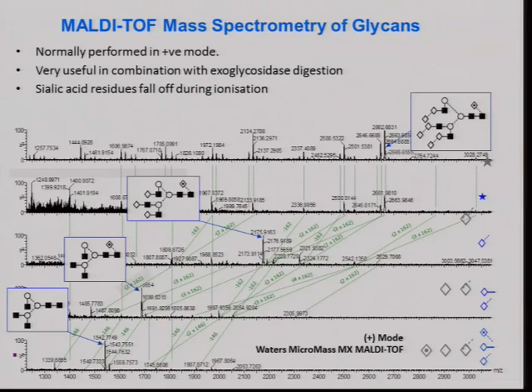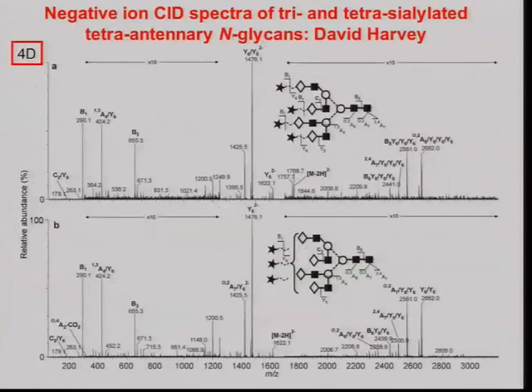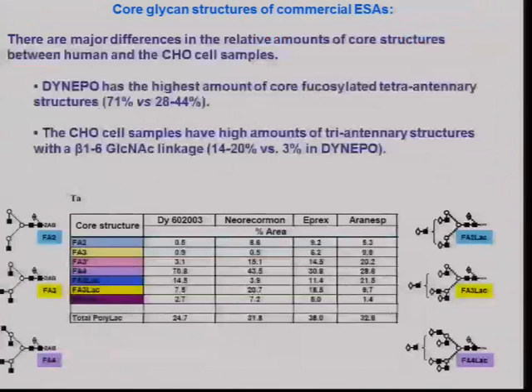So if you really want to use mass spectrometry, that's great, and you can use these enzyme digests just as you would in LC to improve the understanding that you have of the peaks in these different pools. So instead of an LC profile and looking at the enzyme digests, you're going from a mass spec profile to a mass spec profile. This is really useful. And you can pull out a particular ion that you're interested in, this very complex ion here, and you can do fragmentation, and you can identify where the sugars are, and you can get information that you can never get from LC. So this is why mass spec is so powerful.